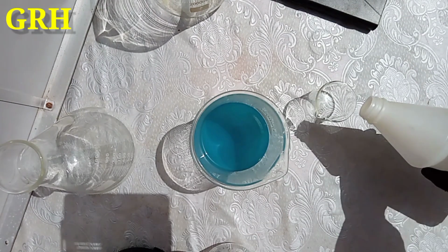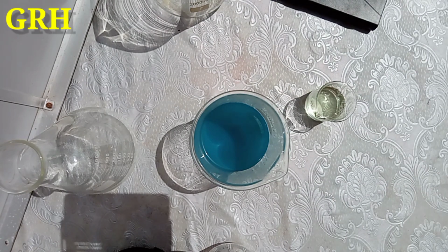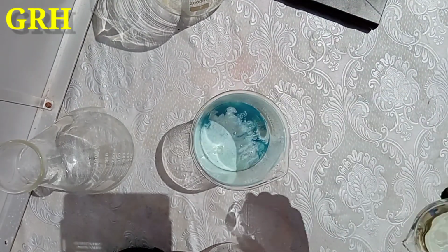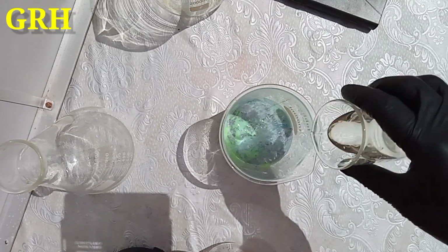You now have a solution containing free silver ions. This is dissociation in the form of a salt dissolved in water. You have performed half of a redox, the oxidizing half, and you are left with a clear acid solution of silver ions.